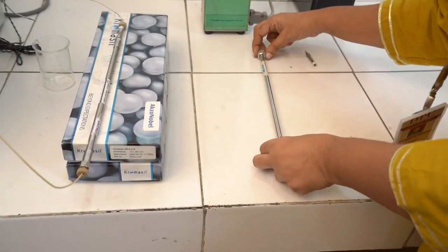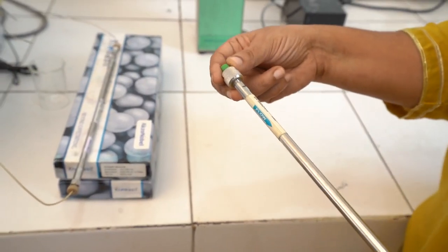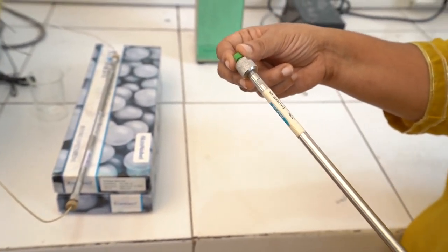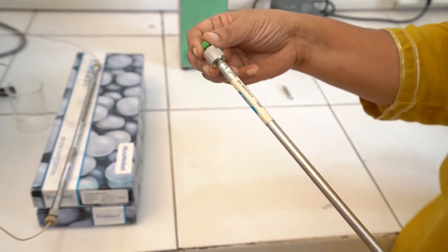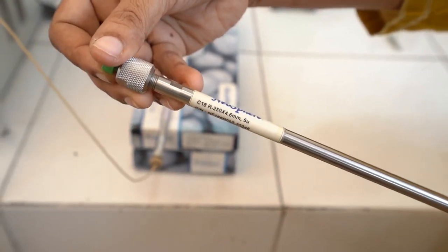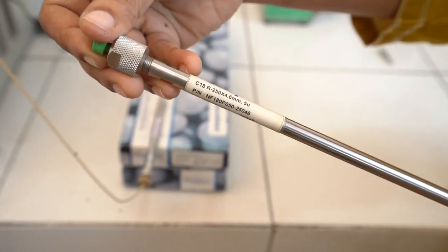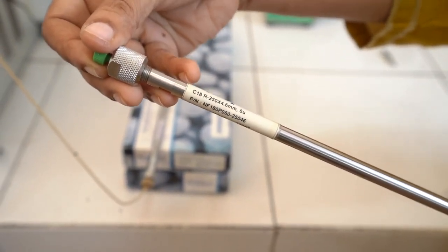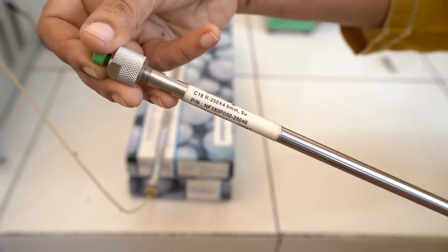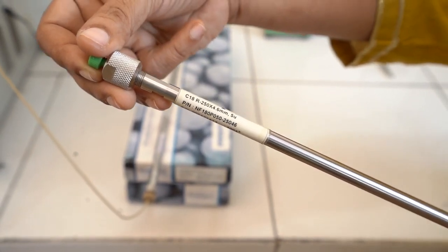This is the analytical column which is used in HPLC. These are stainless steel columns which are packed with the stationary phase. The HPLC columns come in typical dimensions. This is a column of Neosphere of length 25 cm, internal diameter 4.6 mm, packed with a C18 stationary phase of a 5 micron particle size.